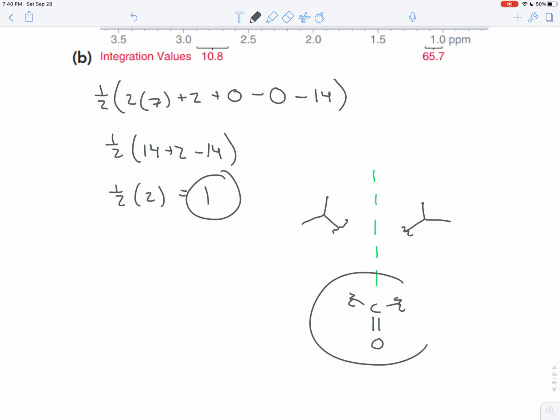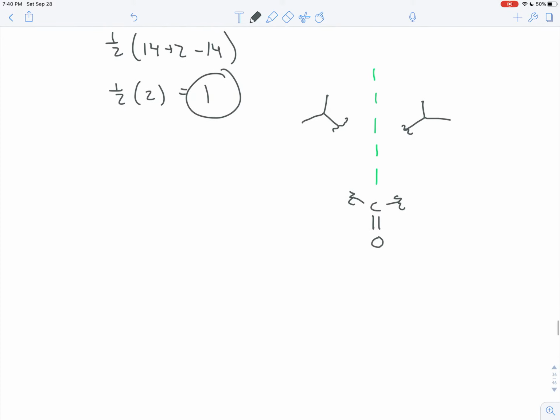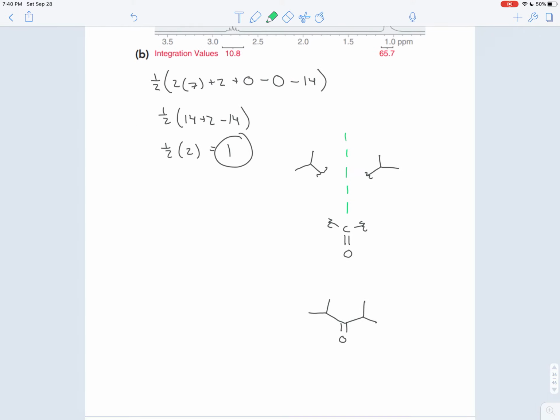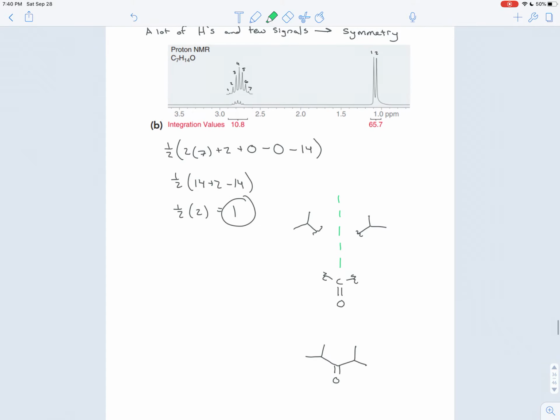And so now this is the piece that has to go in the middle. It's the only one that's connected to 2 different things. And the molecule we must have is this one. That's what you get when you put these pieces together. So a typical person sees this and it's a bunch of gibberish, random shapes, but you see it and you know the molecule that's in your sample.